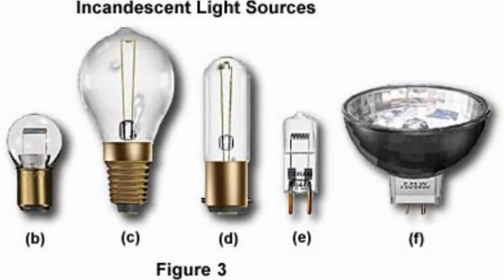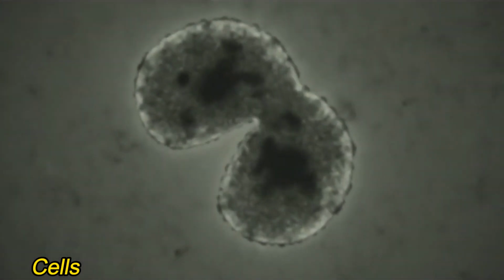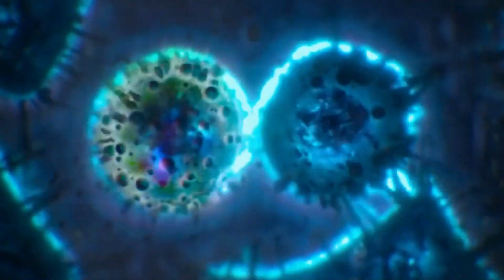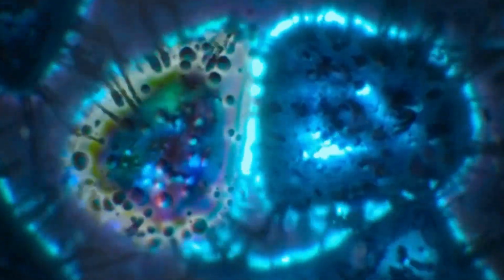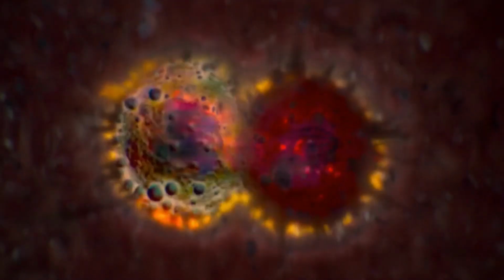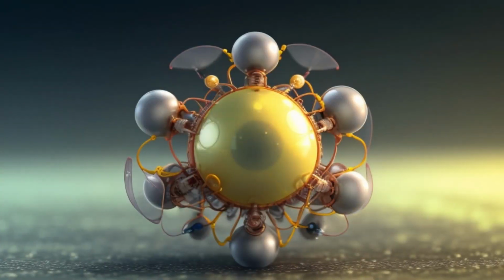Most microscopes utilize an intense light source, often an ultra-bright bulb, to cast light upon the specimen. But the key is not just in the light's intensity, it's also in its direction. The illumination must be precisely controlled, typically through the use of condenser lenses and diaphragms, to enhance contrast and bring out fine details. Further advancements in microscopy have given rise to techniques like phase contrast, fluorescence, and electron microscopy.